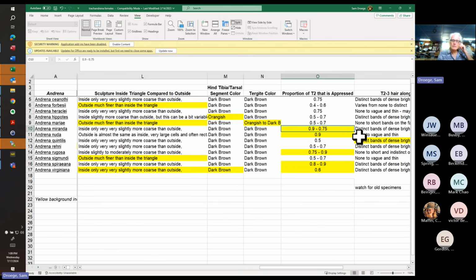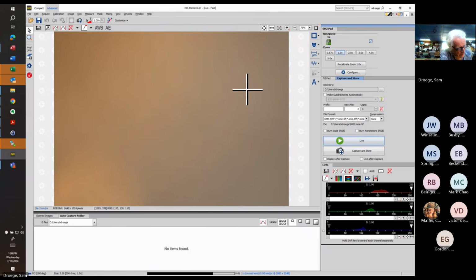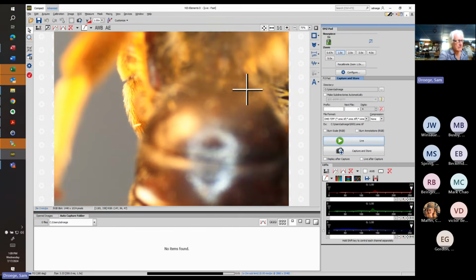Miranda tends to be northern and, I think, midsummer in a lot of ways. But a lot of these Andrena species in particular, unlike their cousins, which are more spring-oriented, tend to be more mid-year. So let me take us to the microscope. Maybe I'll shift the specimen a little bit here for a better look at the abdomen, and I'll bring down the focus.